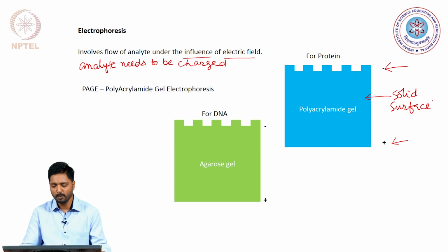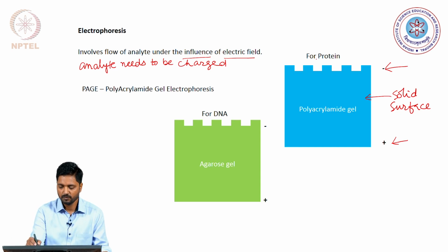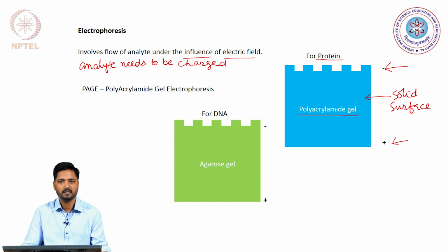So, the most commonly utilized gel frameworks for purifying proteins, for example, are the polyacrylamide gels, and in biological labs polyacrylamide gels are a routine affair.